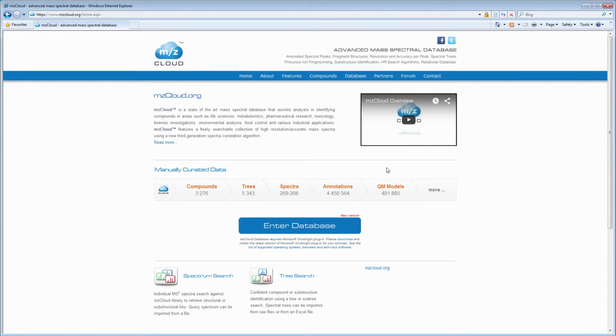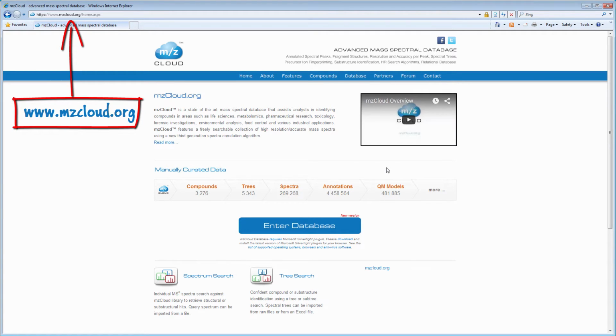One way around this is the library search method, that is taking advantage of the fact that each compound has a characteristic spectrum that differentiates it from others. Like forensic scientists match fingerprints from a crime scene against a database of fingerprint records, mass spectrometrists compare spectra of unknown compounds with spectra of compounds stored in the mass spectral database. In our case, we will use mzCloud, a mass spectral database that is freely accessible on the internet.